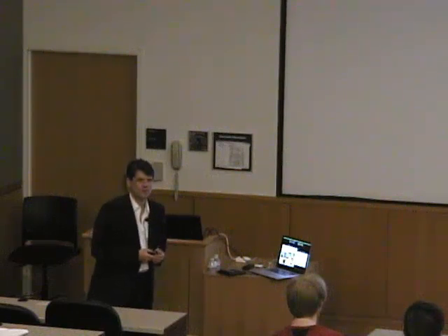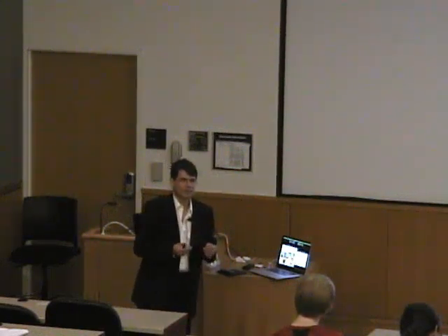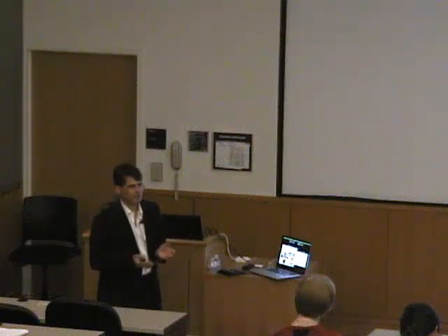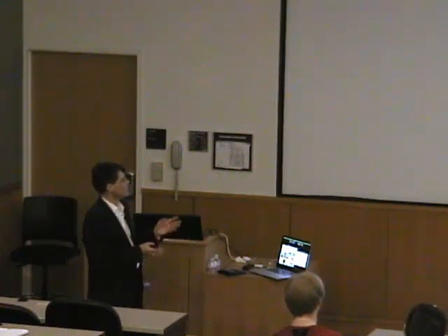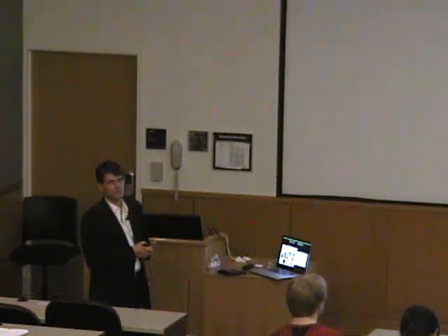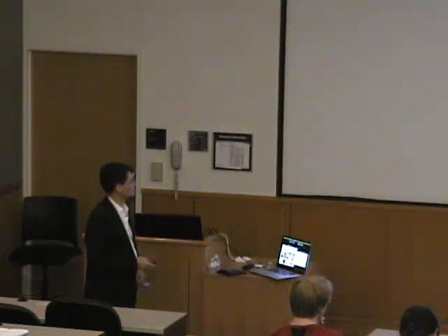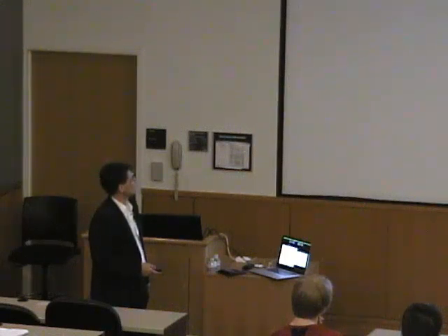If you have a solid sample, say for model complexes, you can also make a mull. The mull will scatter the light, which is not helpful in terms of detecting your MCD signal, but if you do it carefully enough, you can still do it. So there are certain experimental challenges, but with a little bit of experience, they can be controlled. Good. So now why MCD spectroscopy?